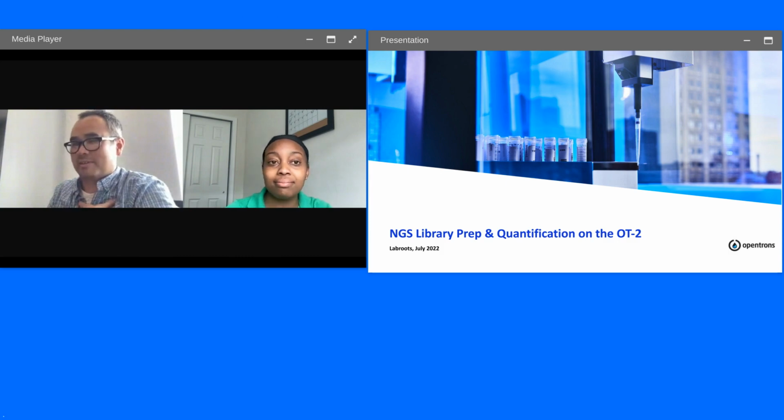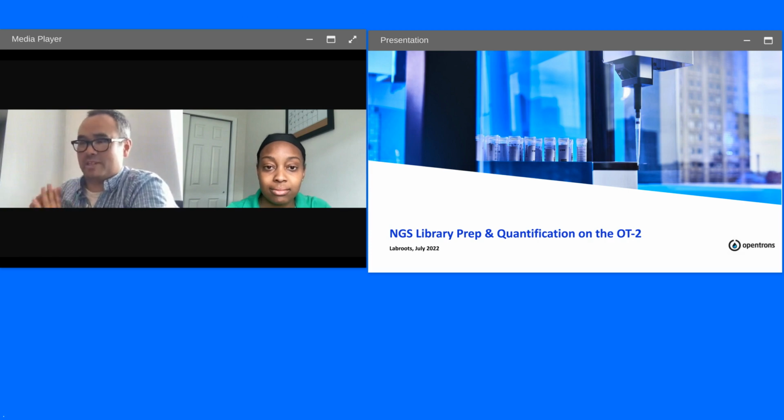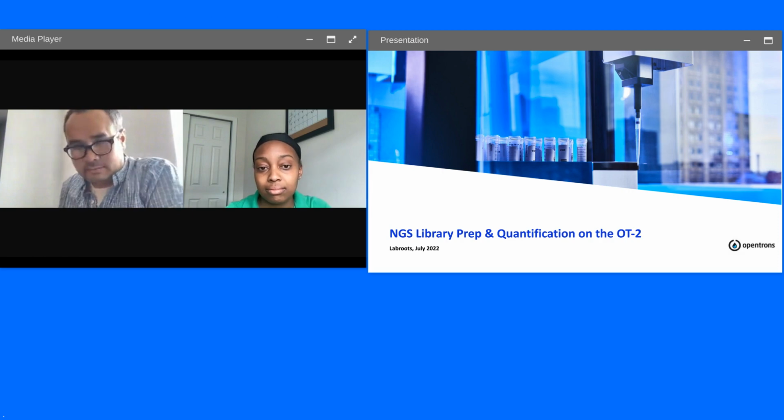I'm not a programmer. I just started learning a few of the Python scripts. So it was something I wanted to set up, and then you could treat it separately. You can make it, I want to reuse tips and then put them back into a designated tip box. Or I want to reuse tips, but then just to be safe, I want to make the pipette head move slower just in case there's any random droplet. So the trade-off is no, it's not on the GUI, but on Python, there's a lot more flexibility in how you could use the tips.